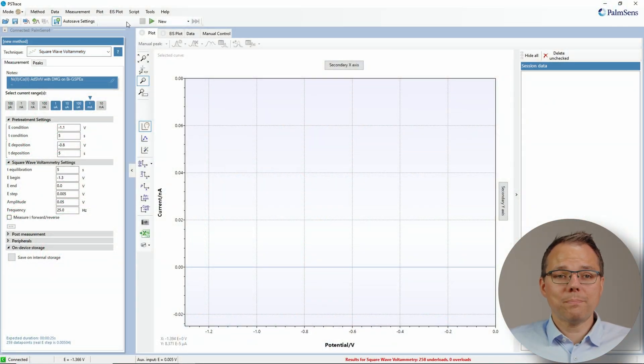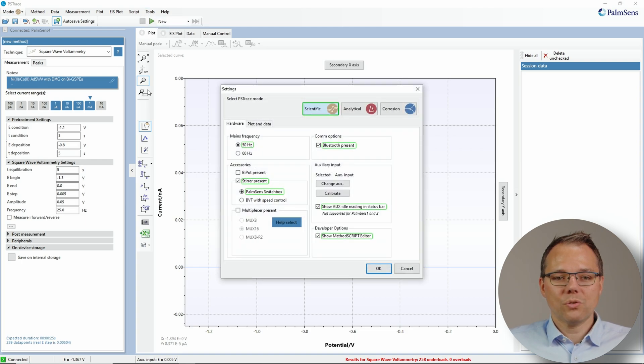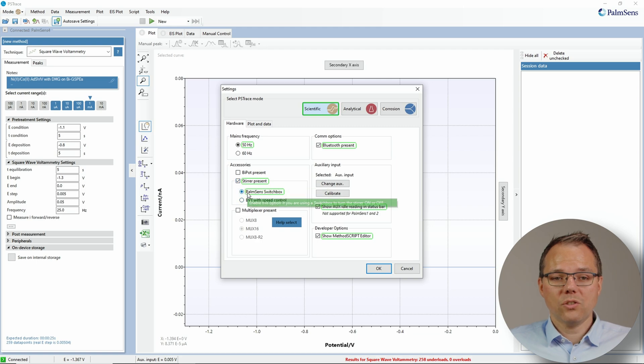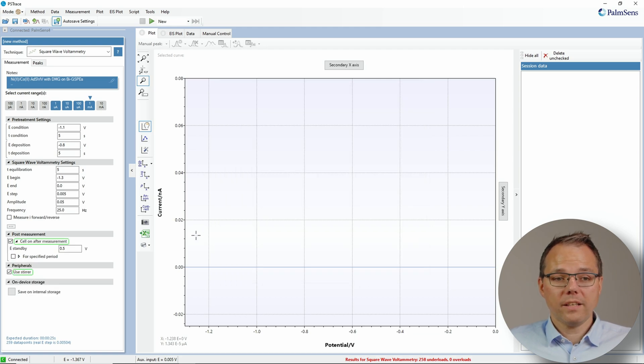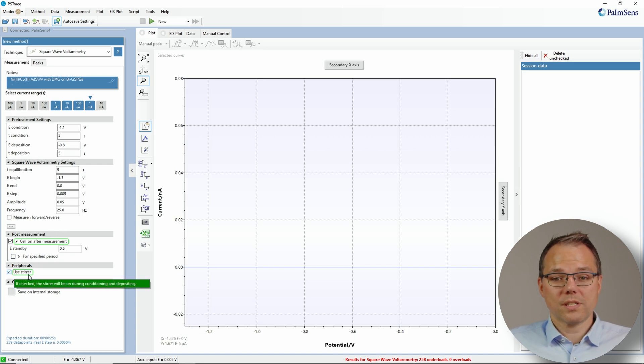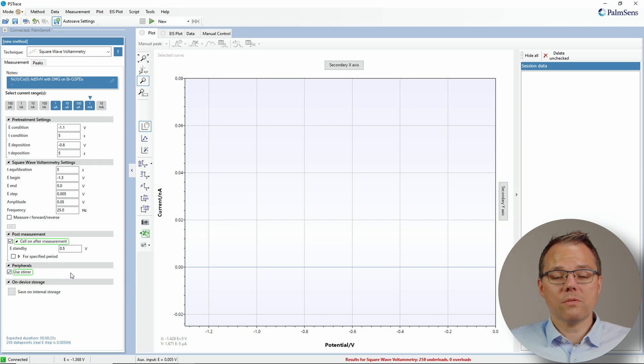We've explained the stirrer in a separate video, but here's a quick recap. Go to Tools > General Settings, choose 'Stirrer is present', and select 'Stirrer with switch box'. Then open Peripherals and choose 'Use stirrer'. This way the stirrer will be on during the conditioning and deposition steps. It will switch off during the measurement, because then you only want diffusion — no convection — so your theory matches your measurement.